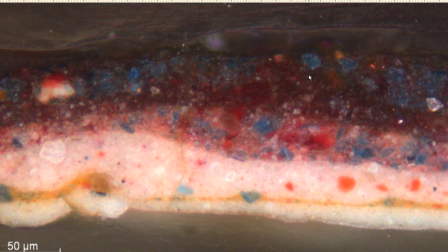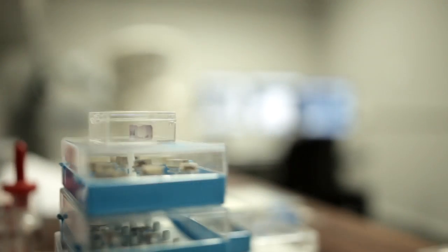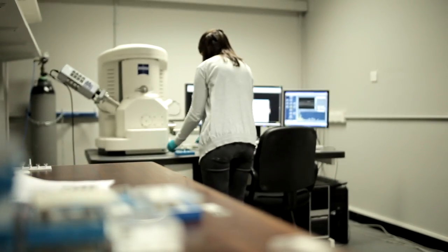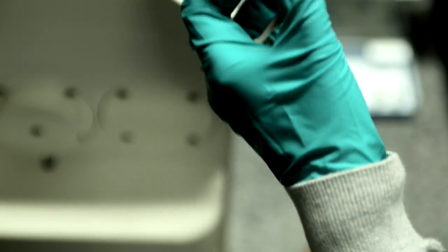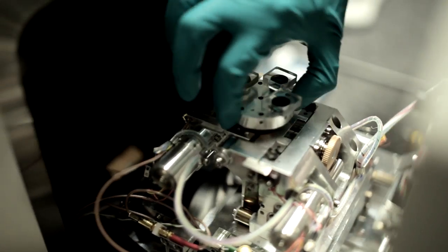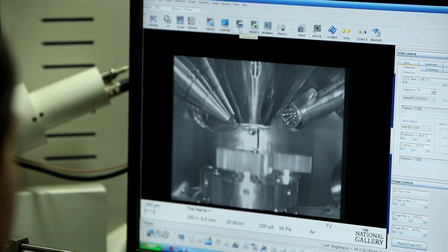This sample clearly shows separate blue and red pigment particles. Other methods of examination tell us even more. This scanning electron microscope, coupled with an energy dispersive X-ray analyser, can determine the composition of the pigments.